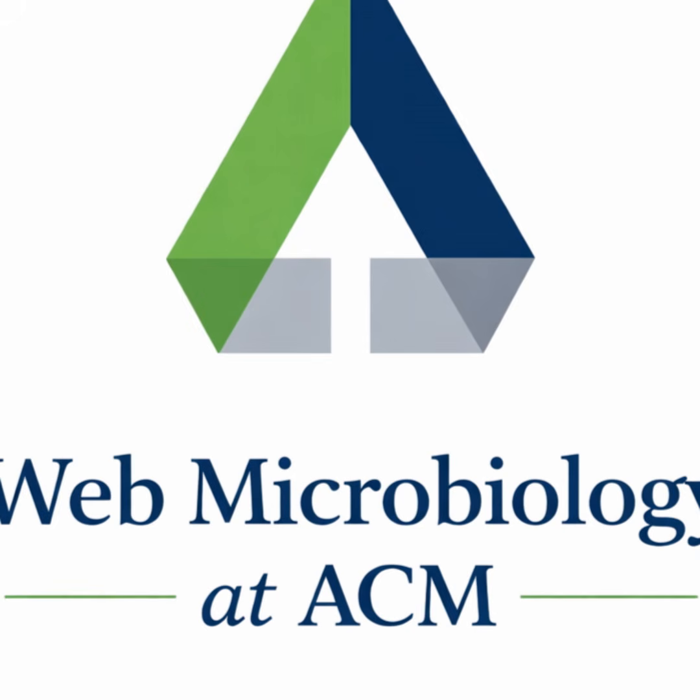Now, in our game Guess Who, one of the most effective early questions is often, is your character a male or a female? Because it eliminates about half of the remaining possibilities. A Gram stain is a similar question for our unknown bacteria. Within a few minutes, this test can separate organisms into 2 major groups while also providing information from basic staining about cell shape and arrangement. A report of gram-positive cocci in clusters immediately suggests a different group of organisms than gram-negative rods, for example. These observations narrow the suspect list and help determine what tests those lab technicians do next.